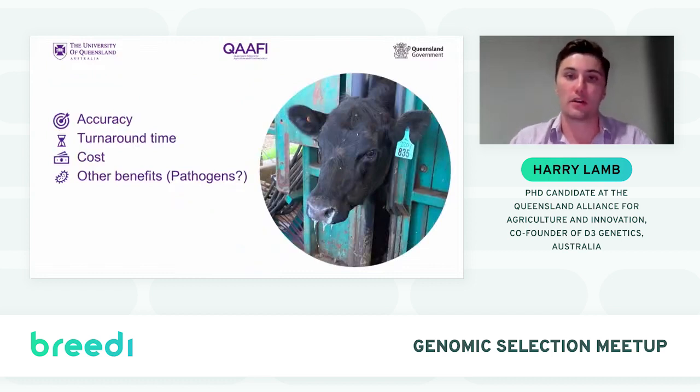So my PhD looked at basically how we could use this device to go out on farm and produce genomic breeding values for cows. And what we wanted to look at in my PhD was the accuracy of using this device, how long it was going to take, how much it was going to cost, and then what other benefits could we get out of using the sequencing device. Next slide.